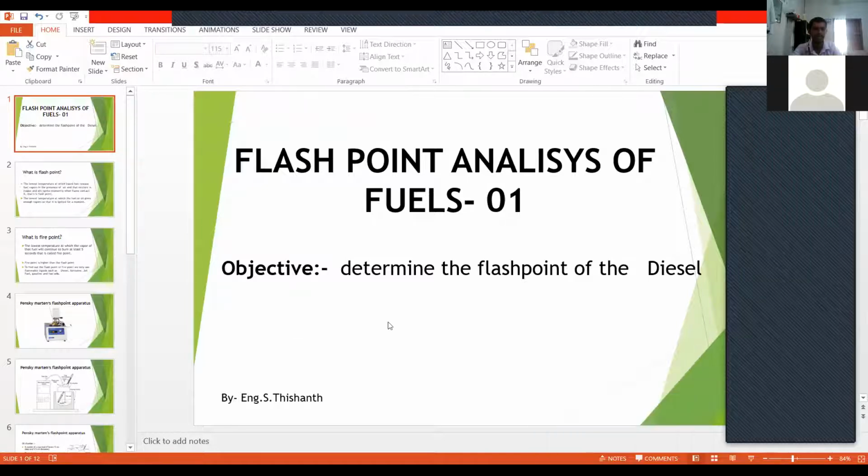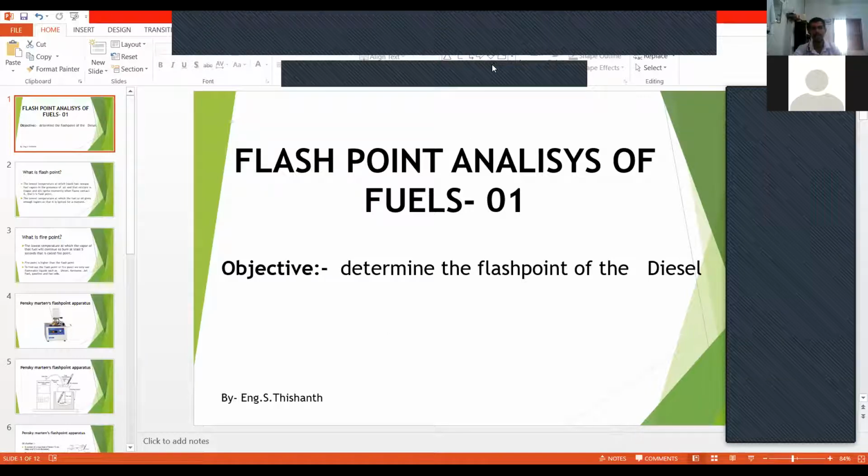So it is about flashpoint analysis, right? This practical is about testing and finding out the flashpoint of fuels, right?